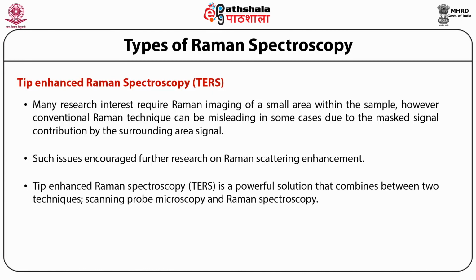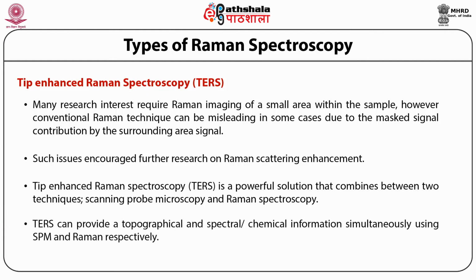Tip enhanced Raman spectroscopy or TERS is a powerful solution that combines two techniques, that is scanning probe microscopy and Raman spectroscopy. TERS can provide topographical and spectral or chemical information simultaneously using SPM and Raman respectively.